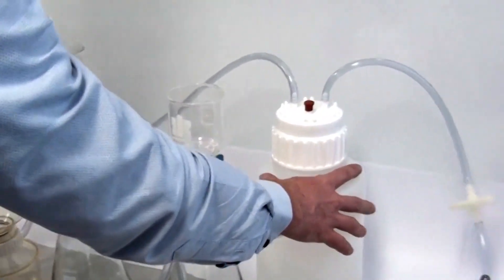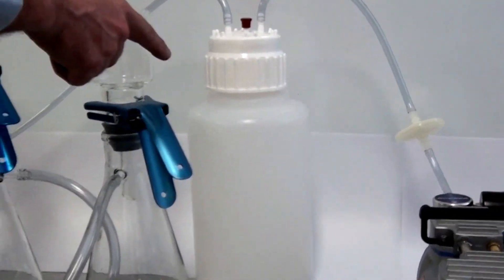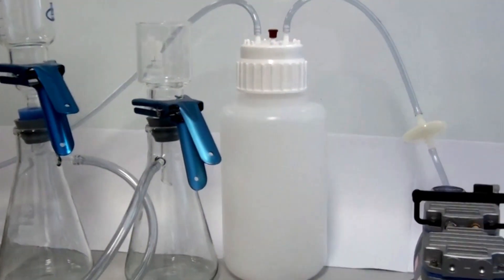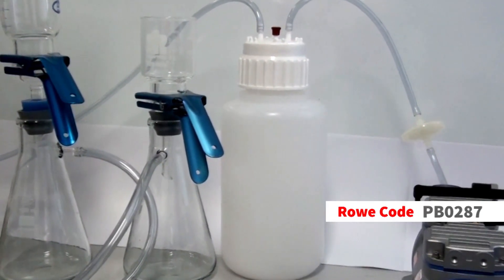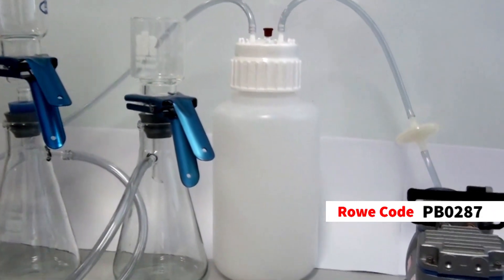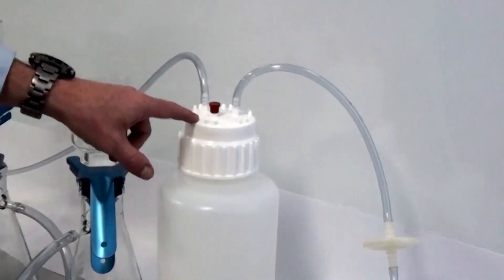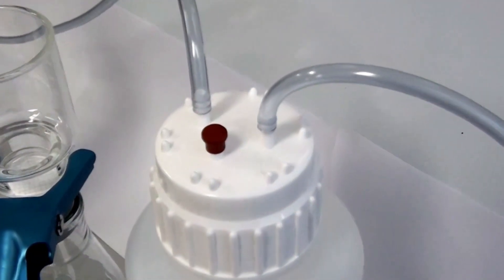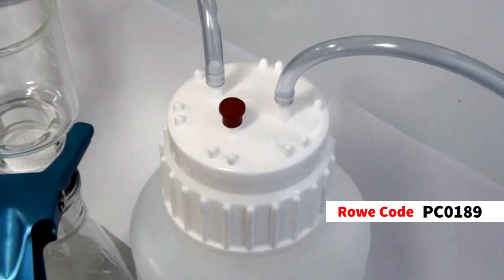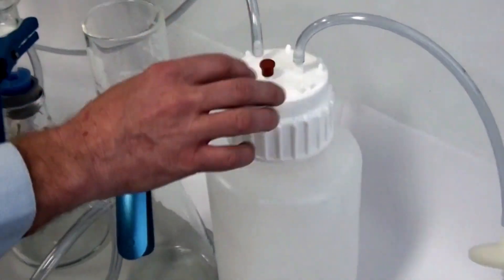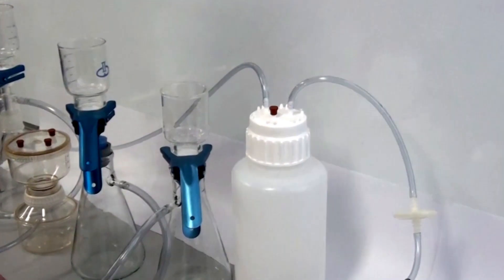Okay. Now we've got the vacuum bottle here, which is a 4L filter, similar to an LG vacuum bottle. So that is our code PB0287. So it comes standard with this cap. This cap with the ports on top is actually sold separately, and that's our code PC0189. So that allows for the tubing to be connected. So this is a water trap. Exactly, functioning as a water trap.